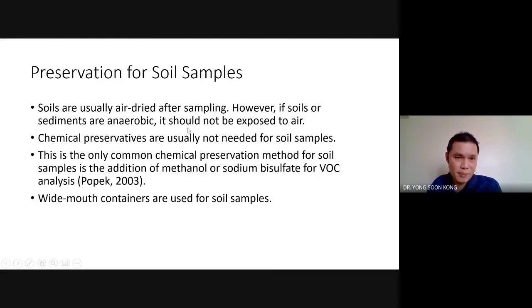Okay, now, in terms of preservation, the usual way is like you did in the soil subject: you collect the soil samples, air dry them, and after air drying, you sieve. After sieving, you put it inside the bag. Okay?